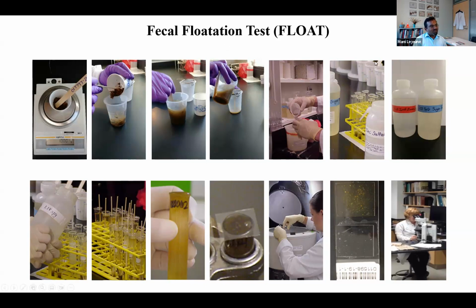The reason I put all these images in here is to explain how difficult and time consuming it is: it takes at least 90 minutes for us to complete this test. And again, we are doing 2 different flotation tests. That's the reason why the float test offered through our lab is a little pricey. It's $25. So you might now understand why it is pricey.